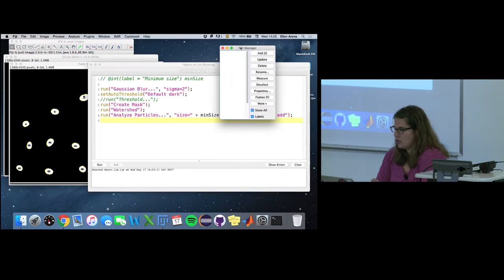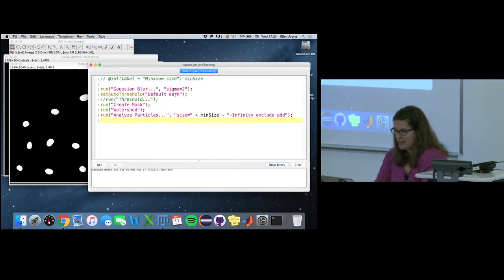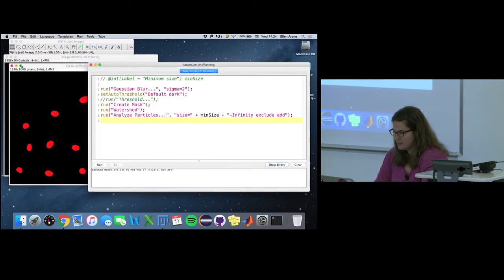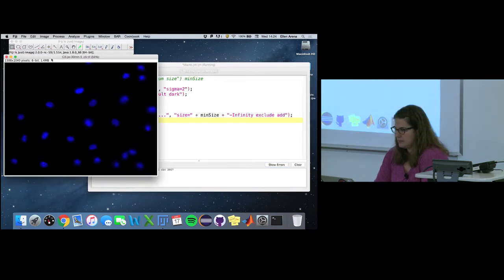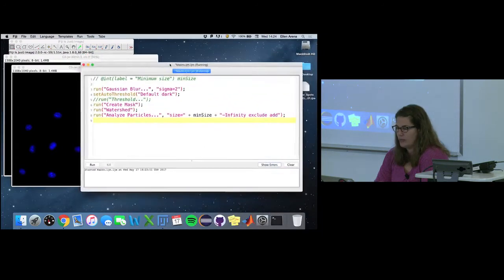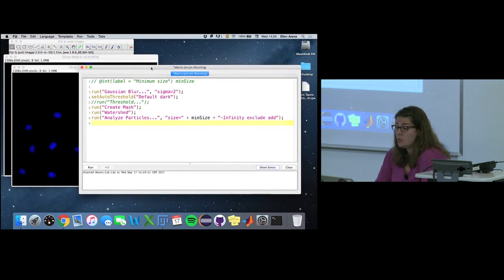Okay, so again, I'm just going to close the ROI Manager and the mask that's created. A lot of windows end up popping up, right? Not save, and then I'm going to duplicate this again. So now I just have two original images, like copies, and the script editor open. But you saw how powerful that is to write. Just this one little line automatically pops up this cool little GUI that you can interact with the user, right? And there's tons of different types, so we'll talk about that too, script parameters.